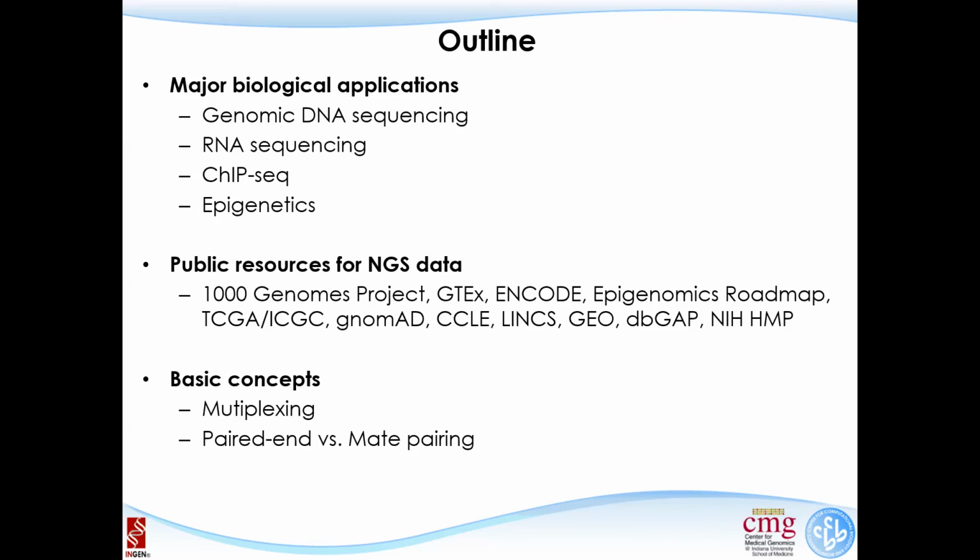So in this particular lecture, I want to give three major components. The first one is I will go very briefly through major biological applications using next generation sequencing. Of course, throughout the whole lecture series we will talk about the individual technologies and their analysis methods.